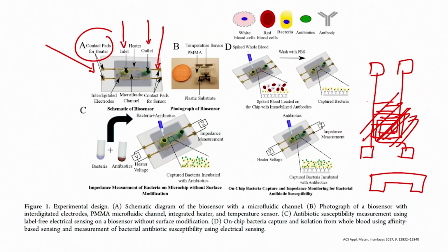So, what do you do with that, right? First you need to create the micro heater. Now, in this technique, since it is a plastic substrate, a screen printing technique is used. Until now, what have we learned? We have learned that everything can be done using a clean room, microfabrication can be done when you have a thermal evaporator or an e-beam evaporator or high-end equipment like photolithography, or you can talk about RIE, or you can talk about wet etching.